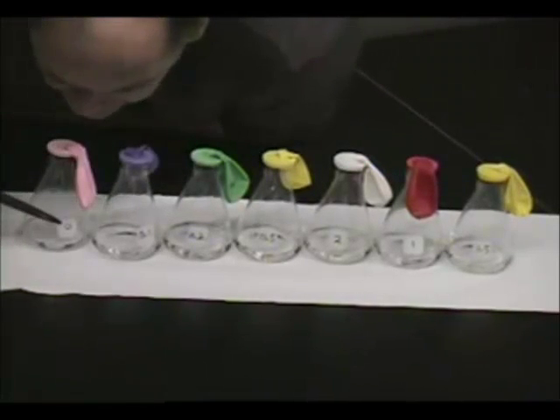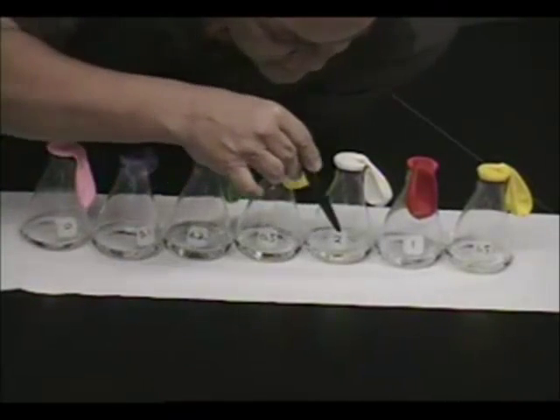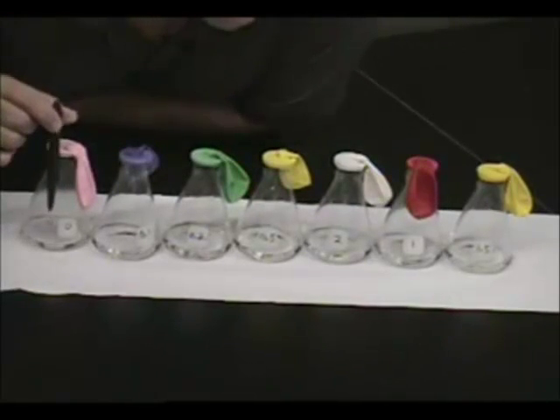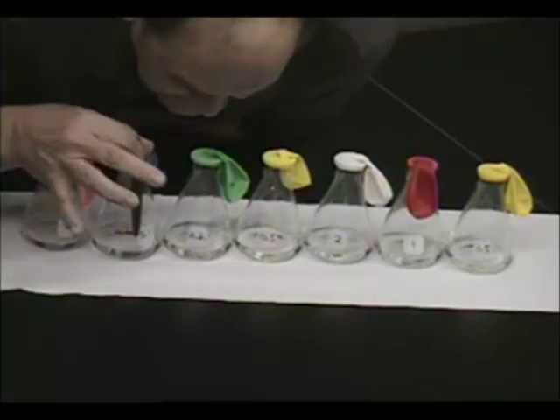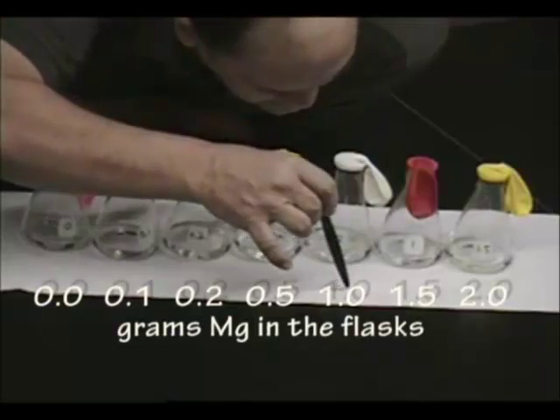Now the numbers you see on the fronts of the flasks are the masses of magnesium in each of the flasks. So we've got no magnesium in this balloon, a tenth of a gram here, two tenths of a gram, half a gram, one gram, one and a half, two grams.